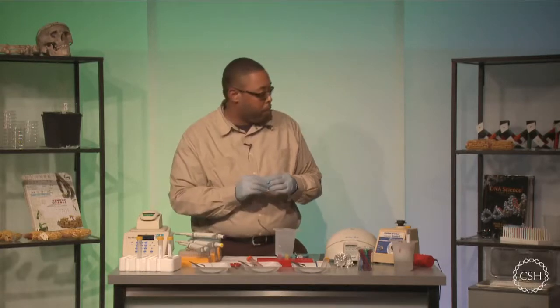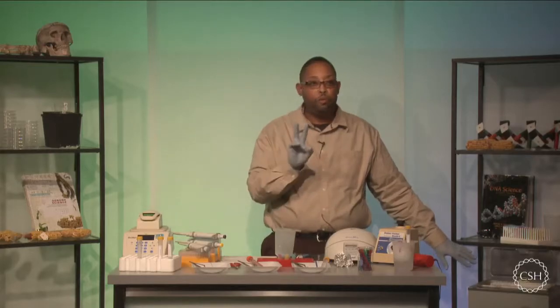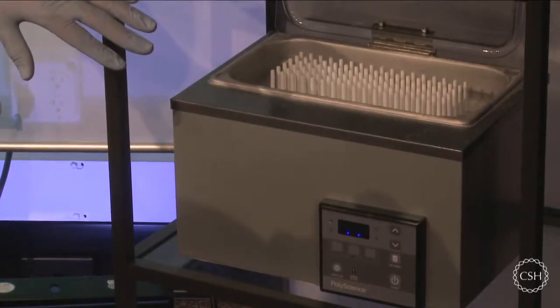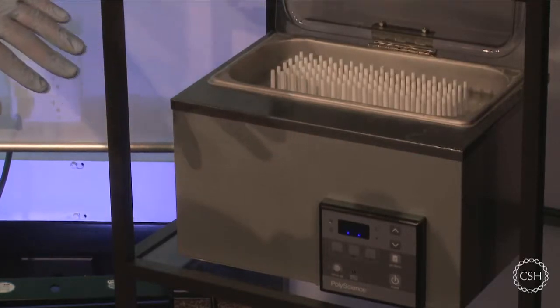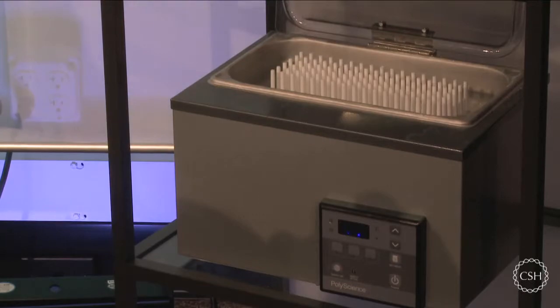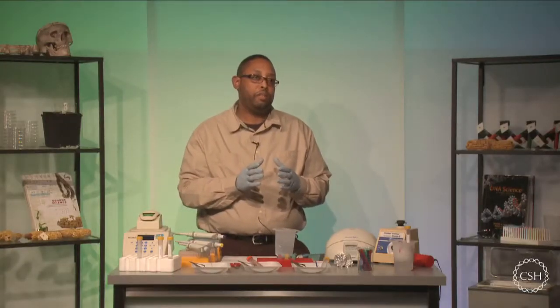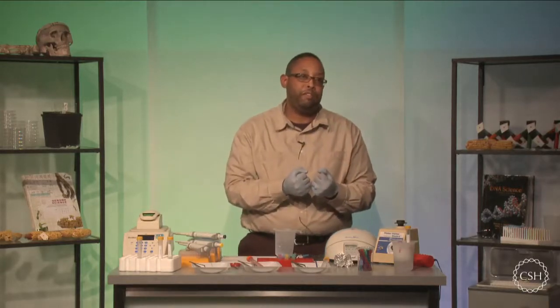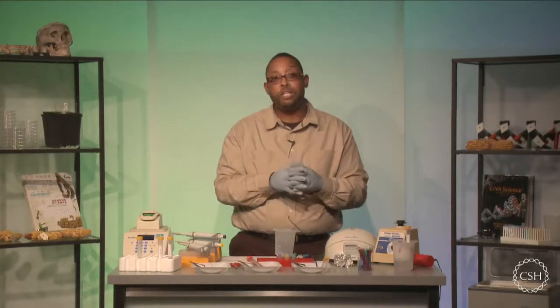Now, one other thing that I'm going to need, which is over here to my left, is an incubator. And there are 2 main temperatures that we're going to have to focus on. One will be 65 degrees Celsius, and that will be the first temperature we use. And then you'll have to have another water bath available at 57 degrees Celsius. If you don't have 2 water baths, give time for the first water bath to move down from 65 to 57 degrees Celsius so that you can have the proper incubation times throughout.